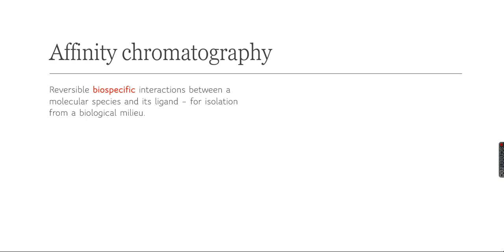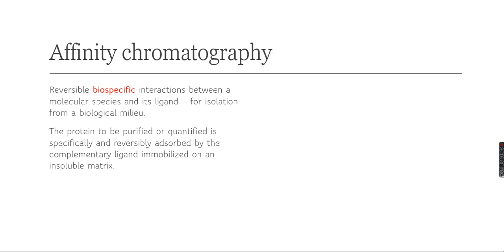So maybe we have more than one, two, three, or 100 compounds, and if we have very specific interactions, or some specific ligands, then they can interact and be separated out of the broth, which is a mixture. Mostly we are discussing protein. The protein to be purified or quantified is specifically and reversibly adsorbed by the complementary ligand, which is immobilized on an insoluble matrix. So we know what ligand molecule we have.